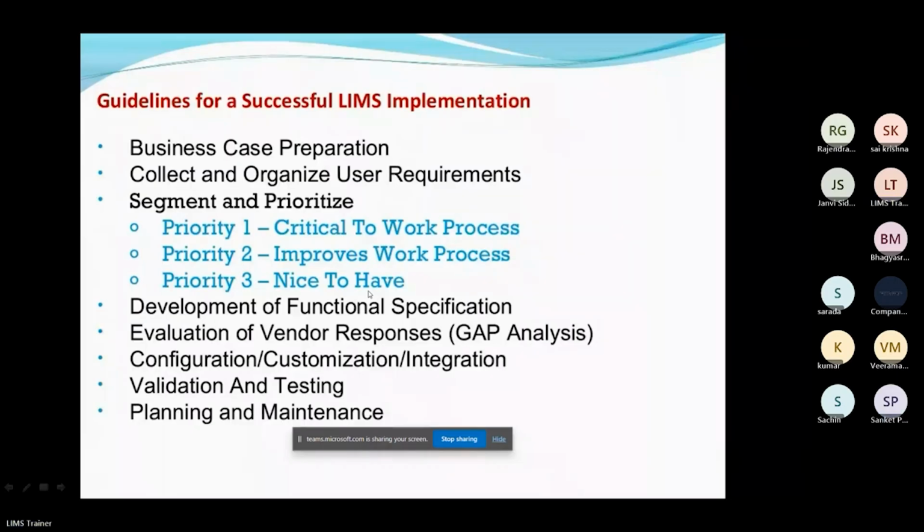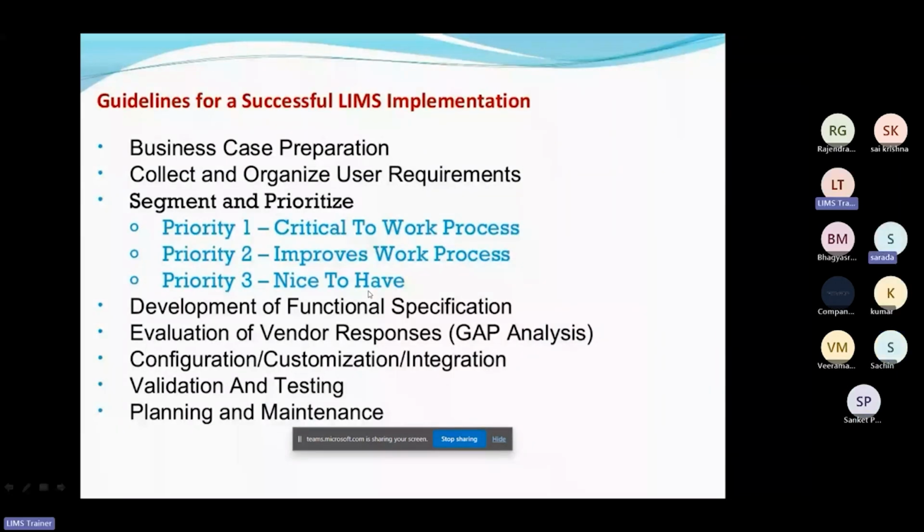Okay. Now comes the development part: development of functional specification. Now the functional specification, you know what a specification is?